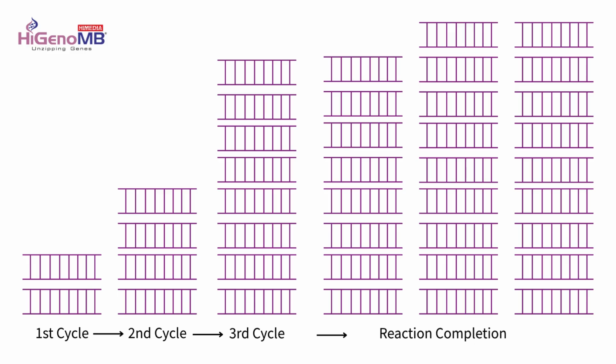by these dyes. And after each cycle, the fluorescence will be recorded by the thermal cycler, for which specific components are available in the thermal cycler. So a conventional PCR thermal cycler, which I explained in the previous part of the session, cannot be used here. Here a special PCR thermal cycler which has special components, which I will be explaining in the later part of the session, will help in recording the fluorescence after the end of each cycle.